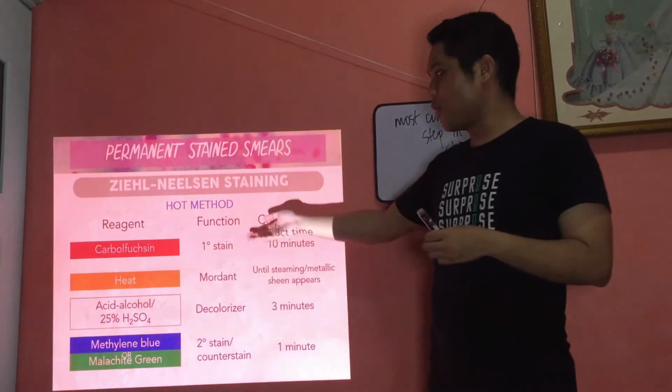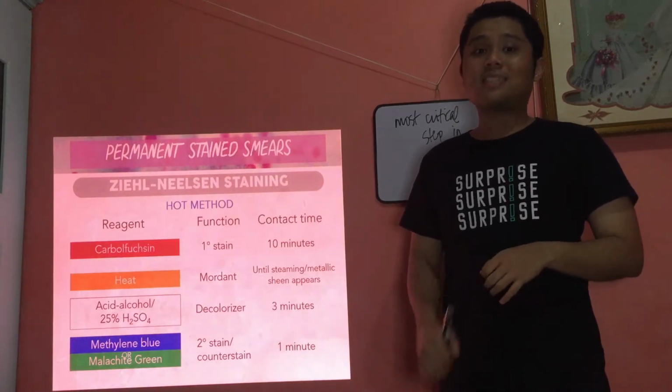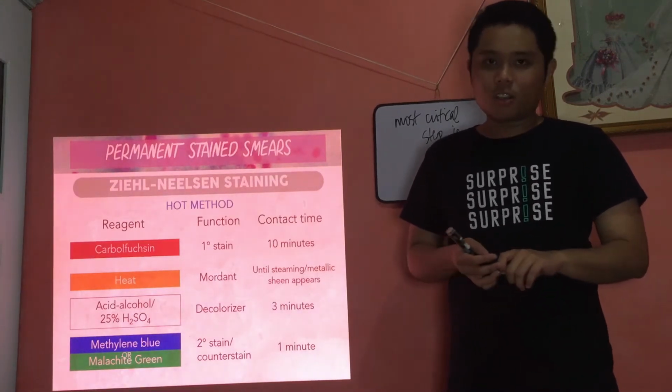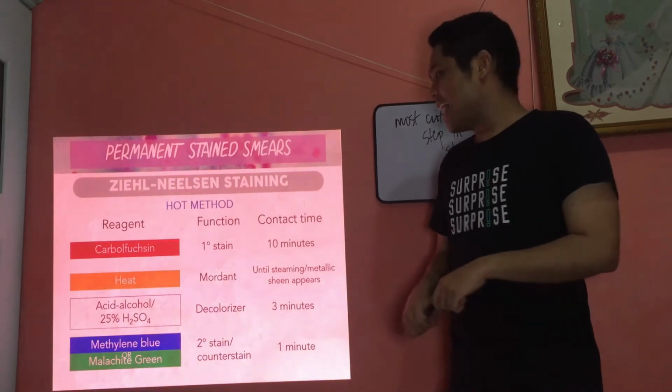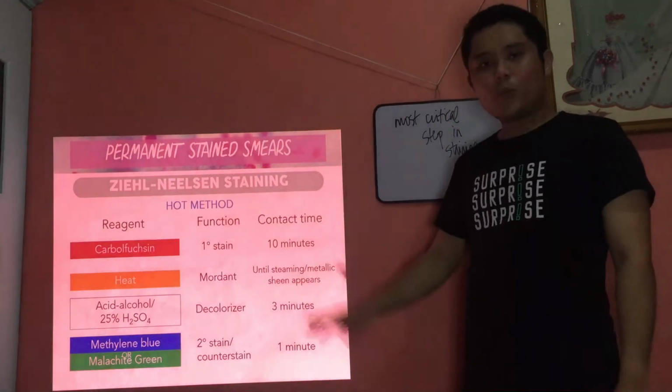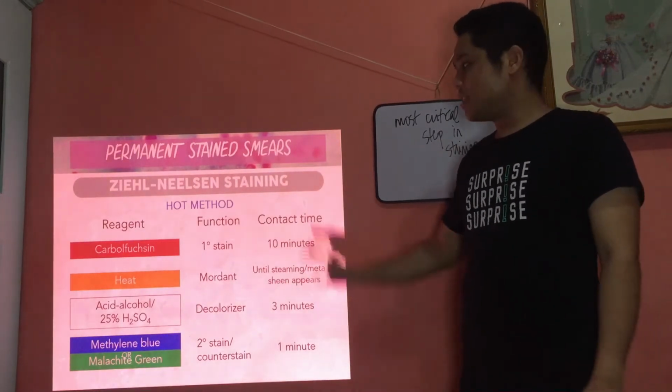That's why it's called hot method, Ziehl-Neelsen. Very common, the most common procedure of acid-fast staining here. In routine hospital labs, both Galeares and Soto, this is their method. Okay, alright. Ayan, and we have the contact time, which varies per manufacturer of the reagents. Okay, alright, so that's it.